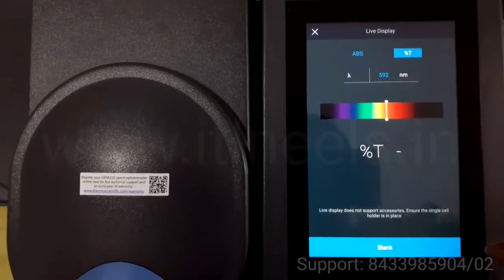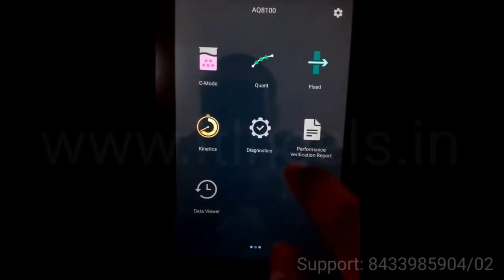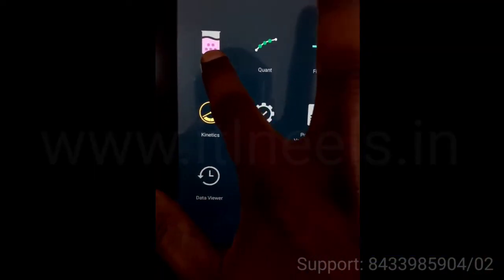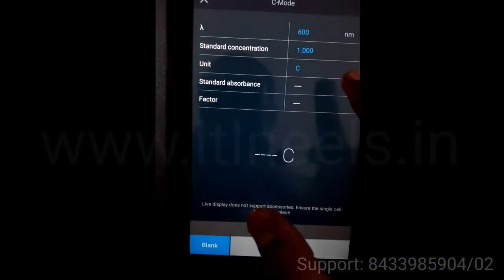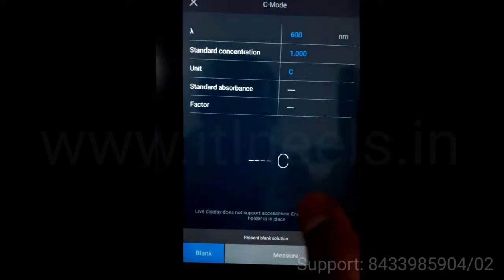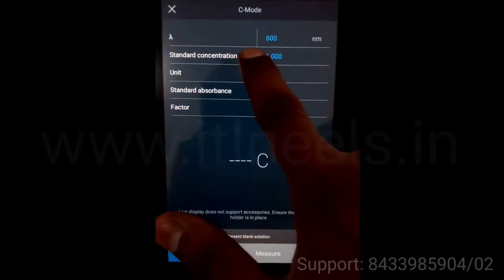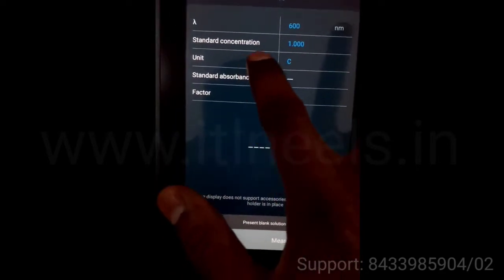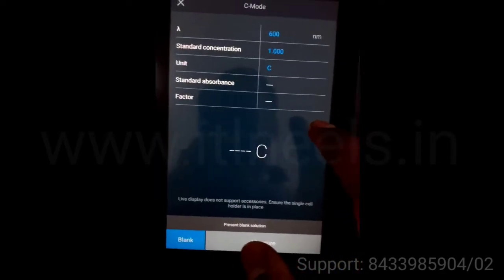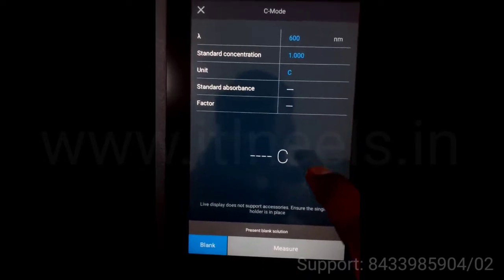Next mode is C mode. In C mode you can change the wavelength and standard concentration. It is used for single point calibration.